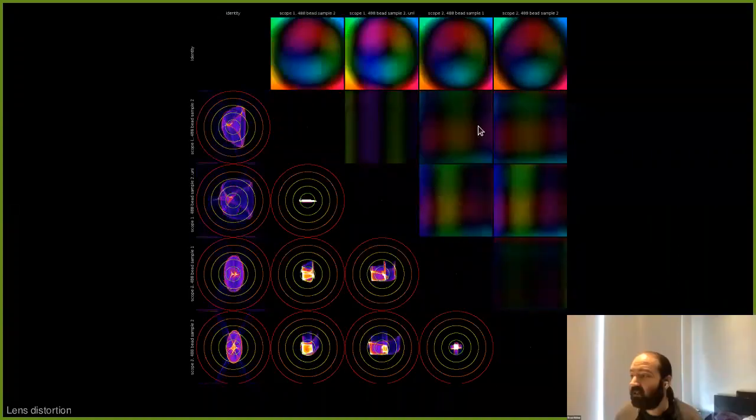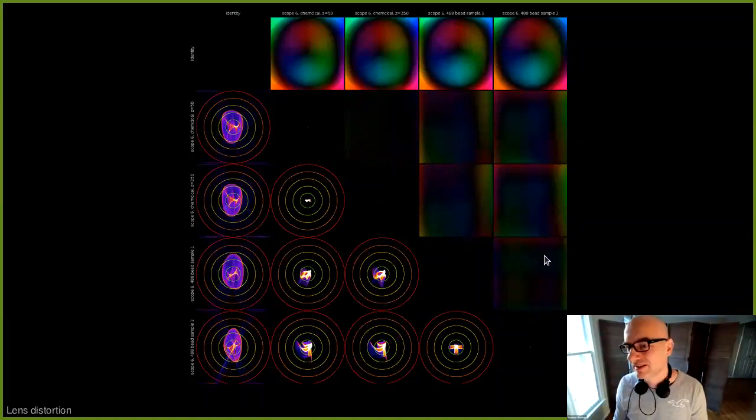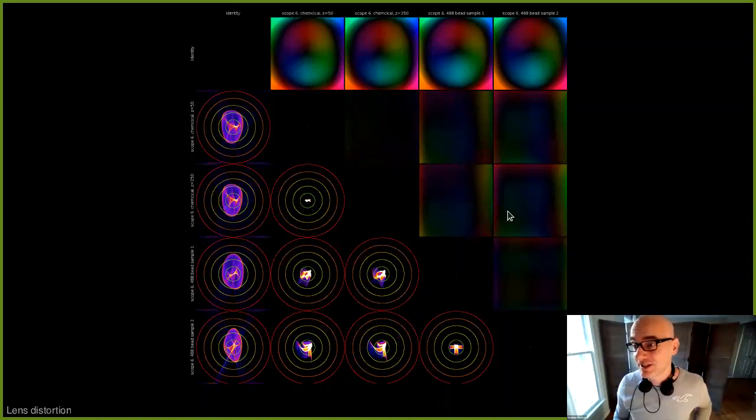And you kind of see that. No, you can still see some stripiness. But it's way weaker because you have this strong edge artifact, but maybe this edge artifact is actually what's causing everything. And yeah, I don't know. It's an interesting point. We haven't tried this.